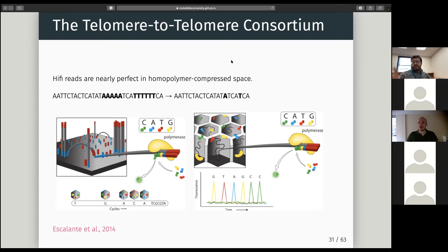Remember, the signal is light, essentially. So if you have too many A's in a row, you may see five lights instead of seven, right? Now you have to be able to say, okay, there are five lights lasting for 5 seconds, so it's five nucleotides, but maybe it actually was six or it was four. And a bit faster and you miss it.